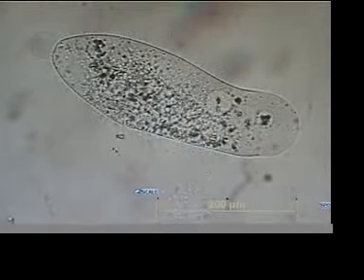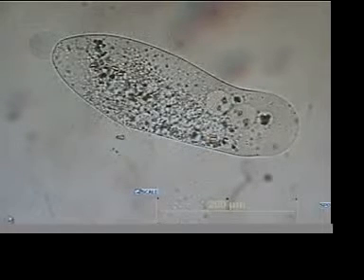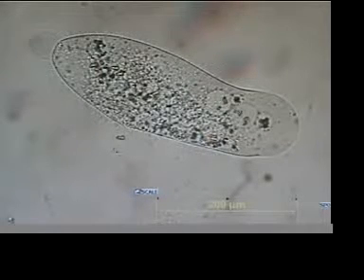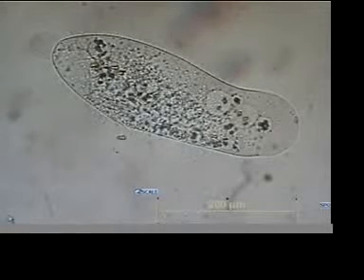Ongoing destruction of a paramecium caused by a Rife-Bare plasma device being fed two frequencies. The plasma device is about 6 inches away from the microscope slide, and you're seeing the results.